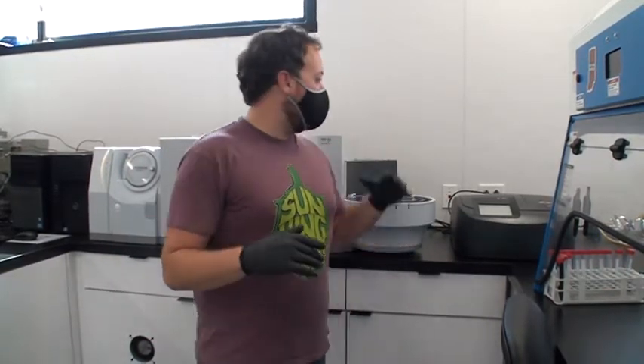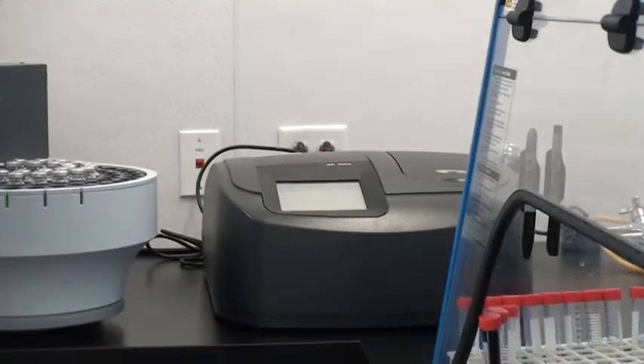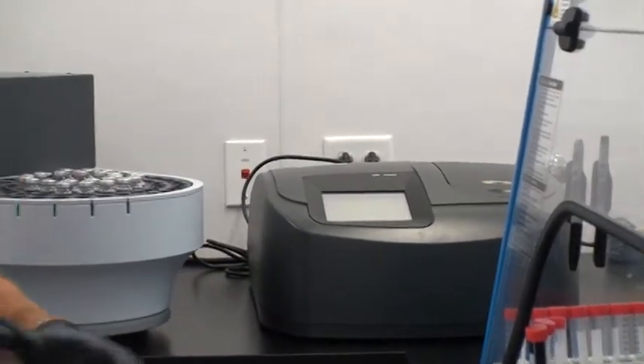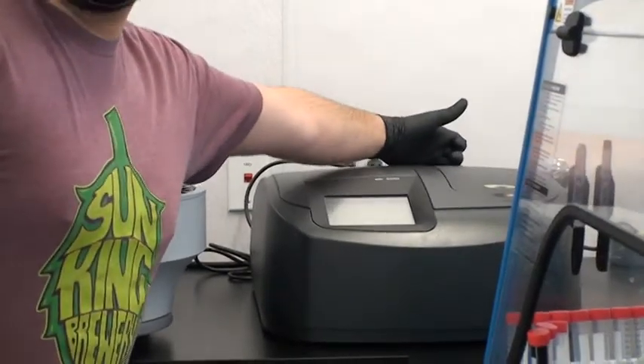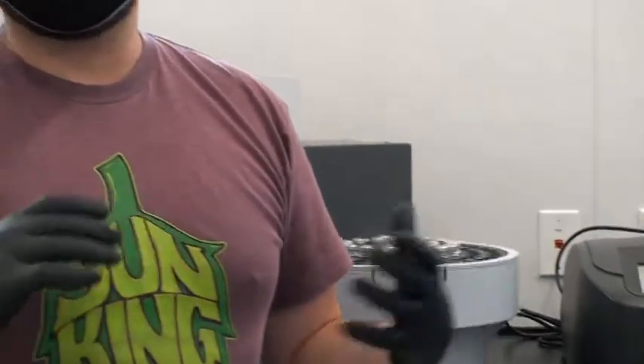We're back in the lab with some instrumentation for chemistry. Let's start with this small one — this is our DR5000 from Hach. It is a UV-Vis spectrophotometer. What this instrument does is use a high-powered laser that you can adjust to fire a specific beam of light at a specific wavelength.